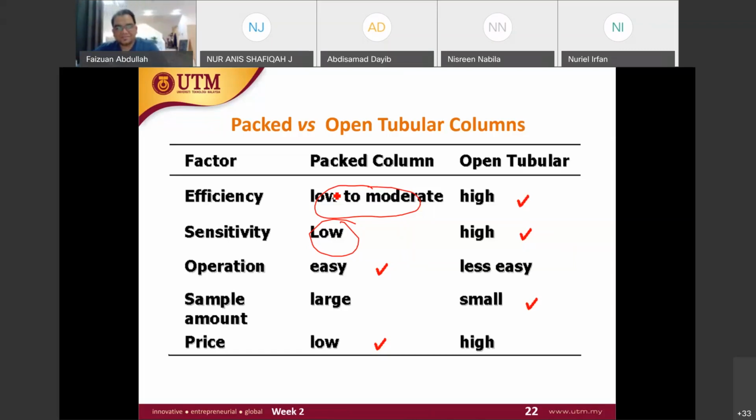All right. That's the example. But in instrument, we need to have a sensitive instrument, okay? If we have an instrument like Irfan, where Irfan is not sensitive at all, the instrument will be useless. So we need to have a sensitive instrument. It's really good, right?